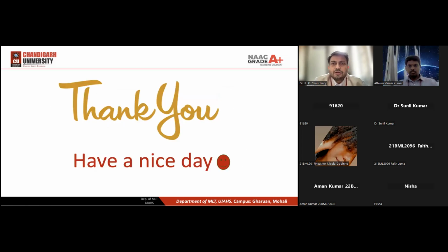Okay, guys. So this is the basic flow cytometry. Detailed procedures we have to discuss more and more. Cell sorting is a big topic. How to use the software is also one of the important parts. We will discuss that later on. So if you have any questions about the basics of flow cytometry, please ask. We have 4 minutes left.